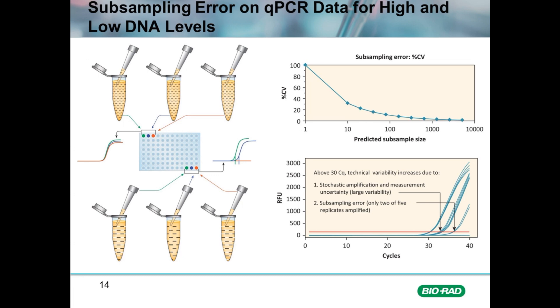The only way to circumvent subsampling error is to take more of the sample. Instead of taking only three technical replicates, it's important to take many more — perhaps six, eight, or even ten technical replicates — to achieve a larger sample of the original interrogated in qPCR. The average of all subsamples is then taken to get the average CQ value, which is more representative of the actual amount of DNA in the sample.